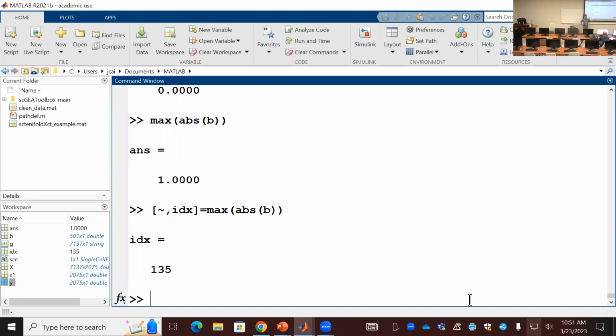The beta value tells you the contribution of each independent variable to explain the predicted variable. I think that's enough for this linear regression.